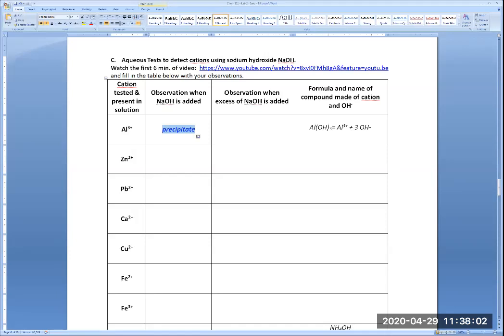When you mix two clear solutions, sometimes you see a cloud forming, like the solution is not clear anymore, it becomes opaque, and you see a thick mass obscuring the visibility through the solution. This is called a precipitation reaction when you observe that.